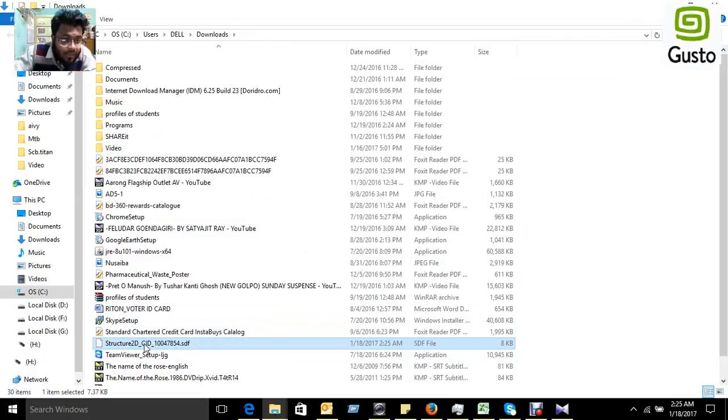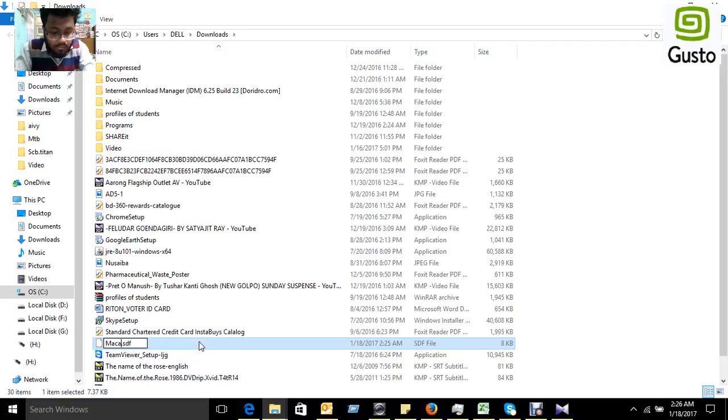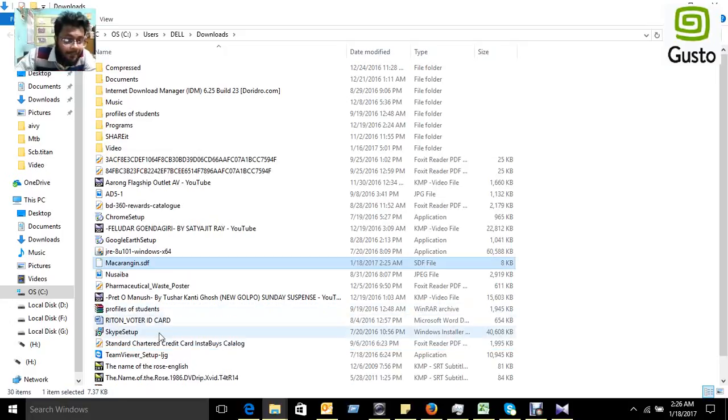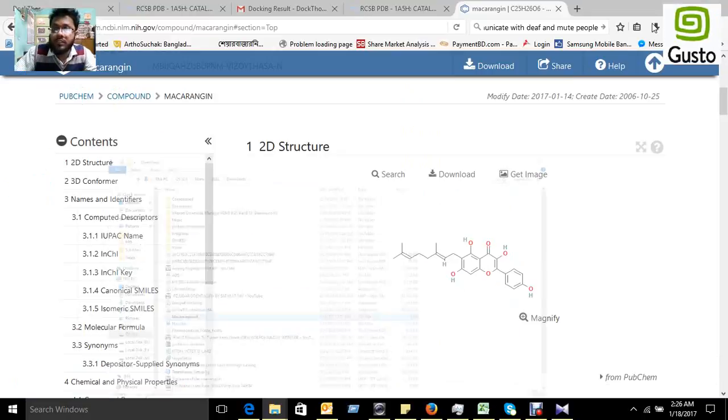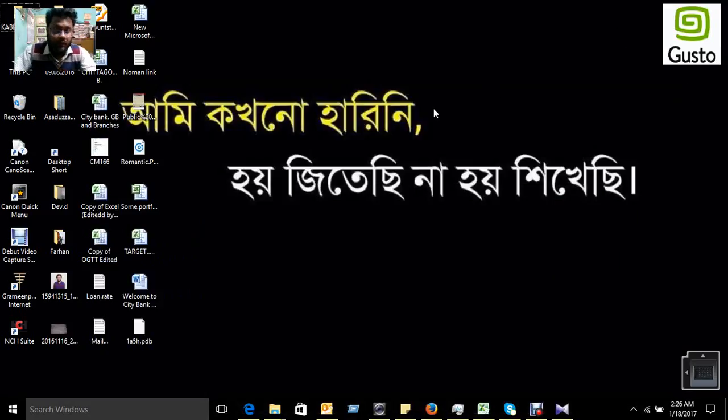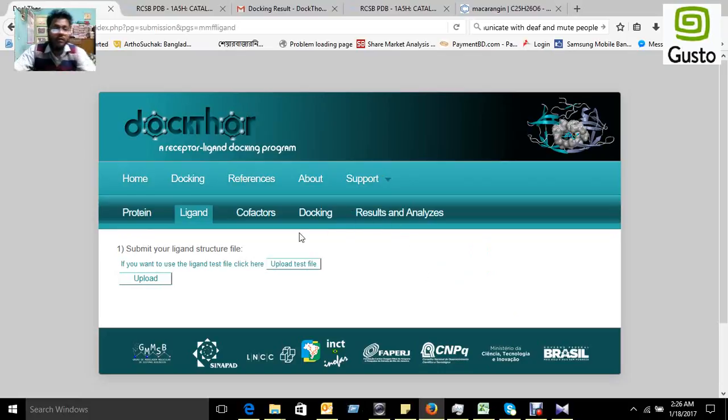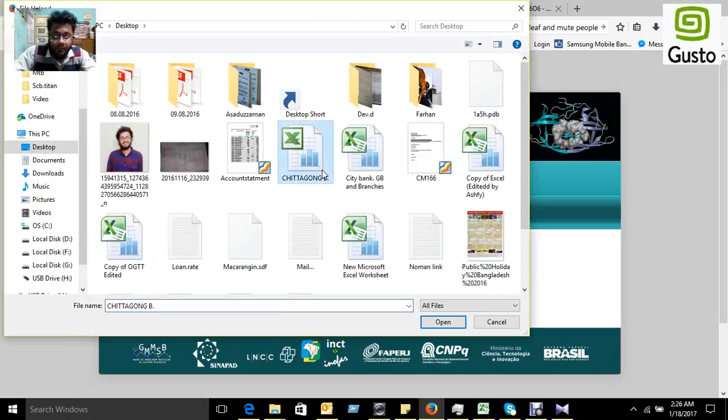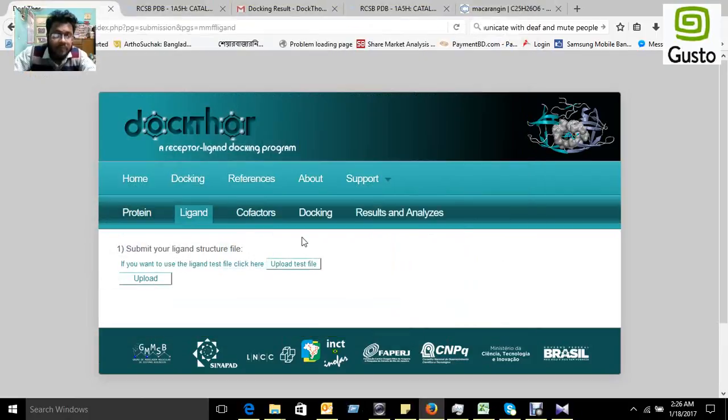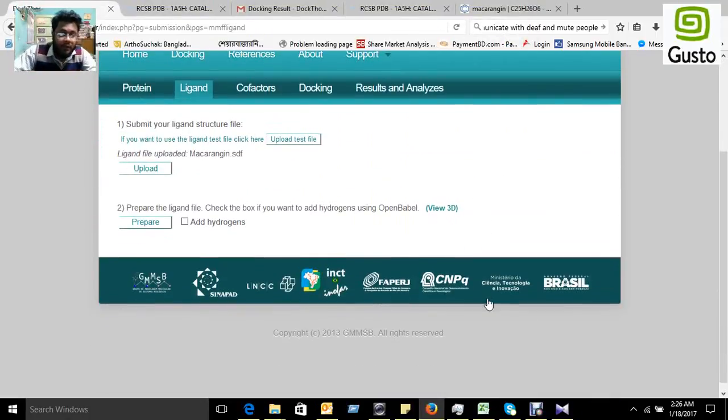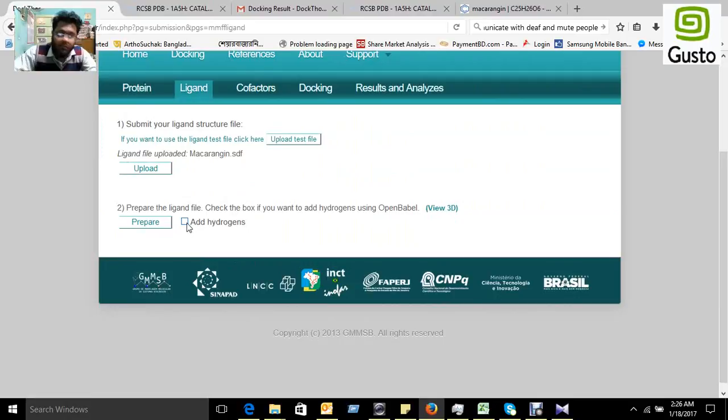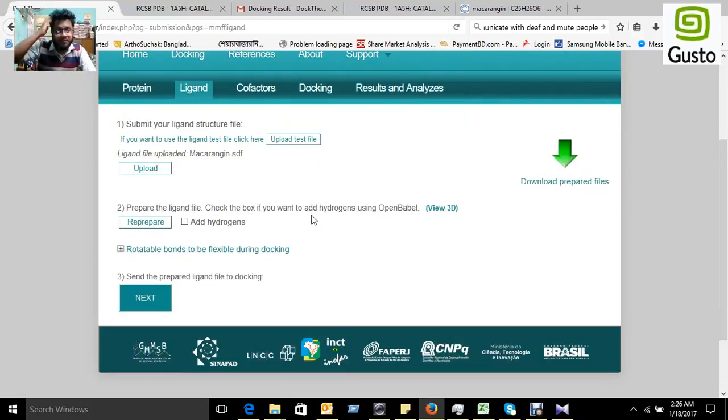We found it, just rename it. We found it and then move it to desktop. Now we have to again go to the Dockthor and select our ligand structure, the macaranzine. Here it is, you can select it. Now prepare the ligand. You can add hydrogen or you can not, both are available. We just keep the hydrogen and prepare the ligand, and go for the next portion.